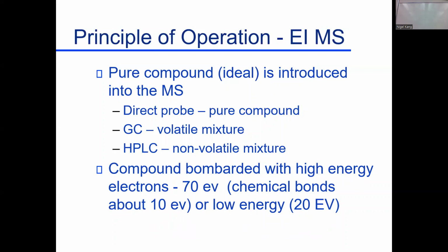Ideally, a pure compound gets into that source area. It doesn't always have to be a pure compound. It can be a mixture, darn it. But hopefully, your compound coming into that ion beam is a pure compound. And then that's essentially where we blow it.